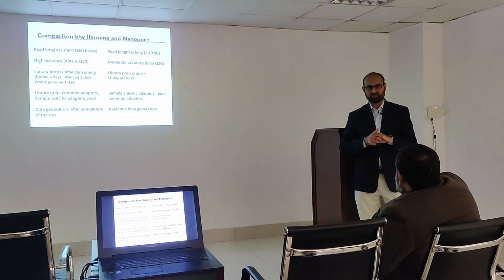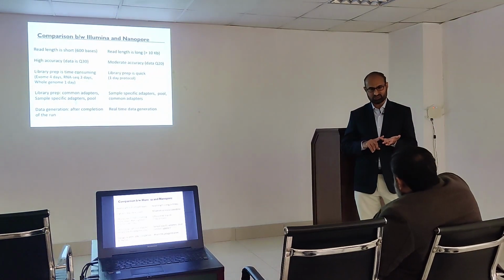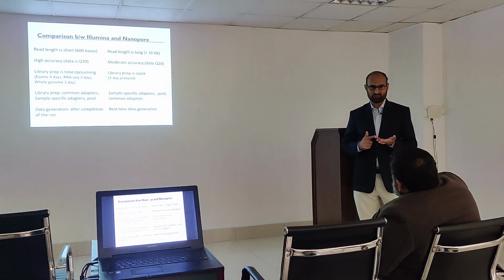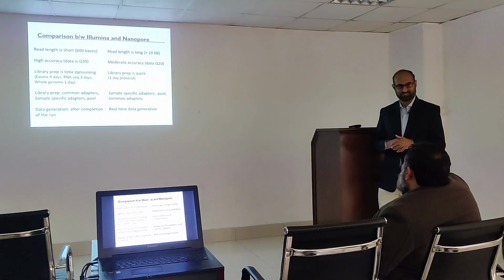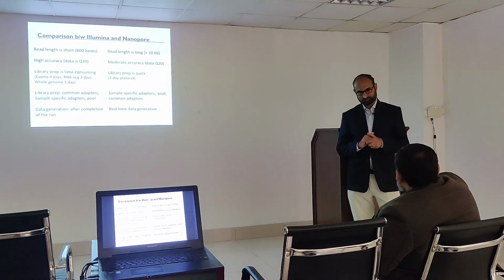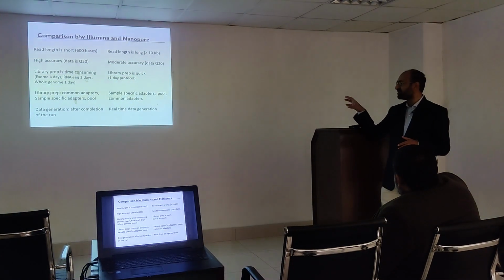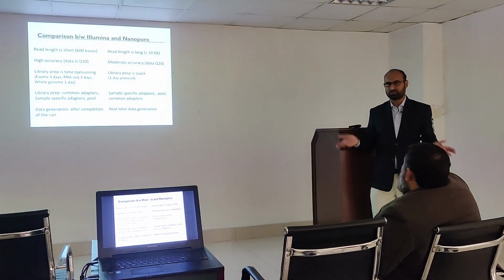These enzymes are provided by the manufacturer. Like Illumina, they have their own, and Oxford Nanopore, they have their own, and usually they do not disclose which specific enzyme is used. The third is the ligation you make at the end of each fragment. Exactly, they provide a kit for that too. So for all these modifications, the company provides a kit. We have to follow the kit protocol, which we will do today, inshallah.